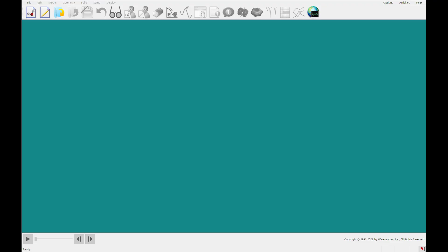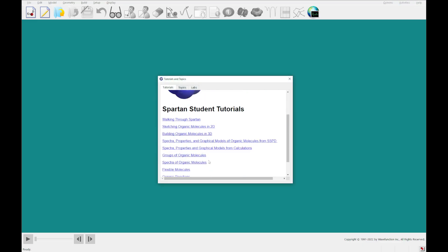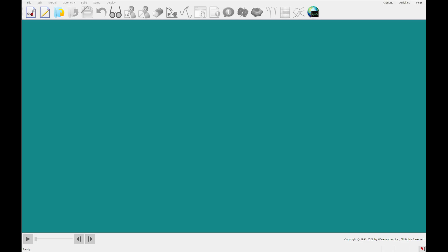As always, to get to the tutorials, you'll go to the Activities menu up at the top right, click Tutorials, and then today we are on this 7th tutorial, Spectra of Organic Molecules. You're going to go ahead and click that and open a PDF.